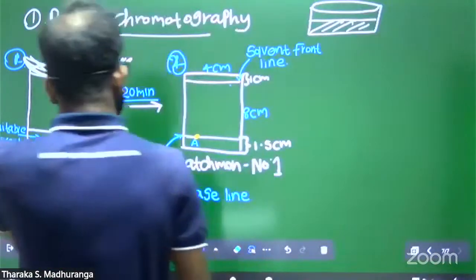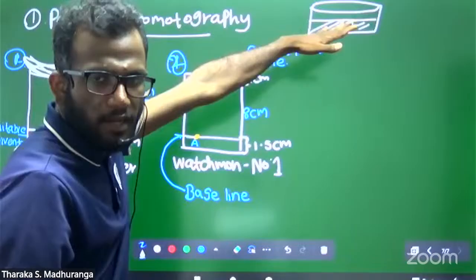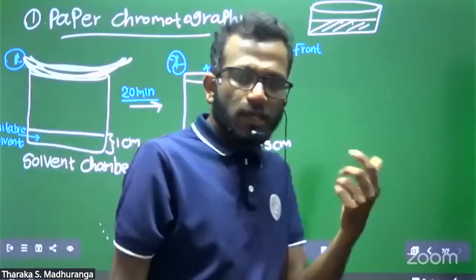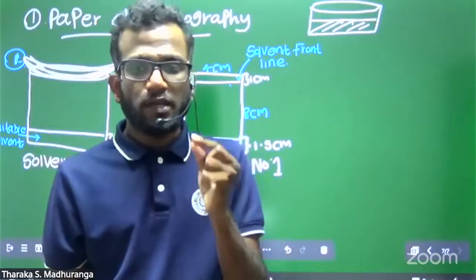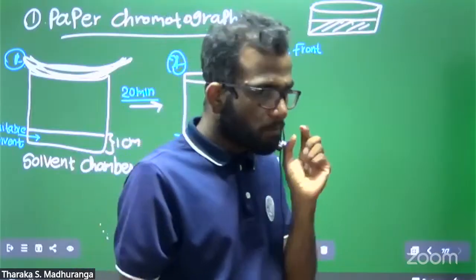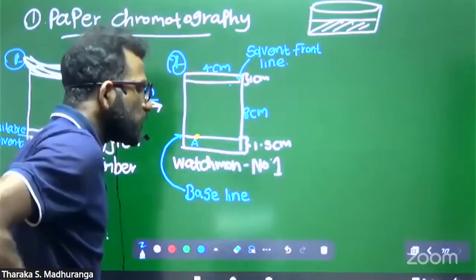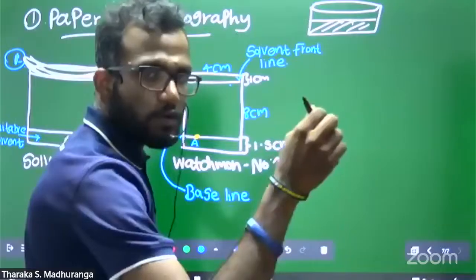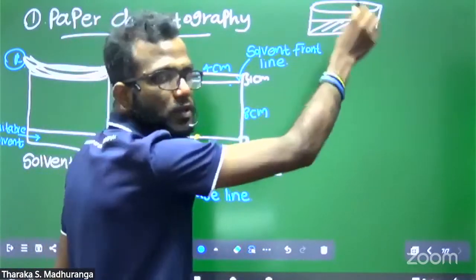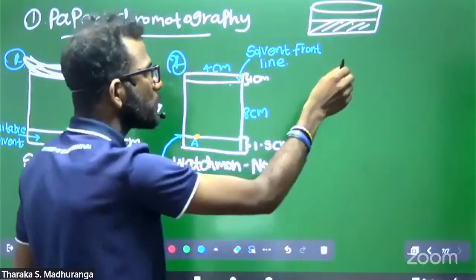Then, to identify this crude product, I need a special sample. In the laboratory, you have to find a purified cinnamaldehyde compound. Using the same method with the glass rod, we take a sample from the purified cinnamaldehyde solution.